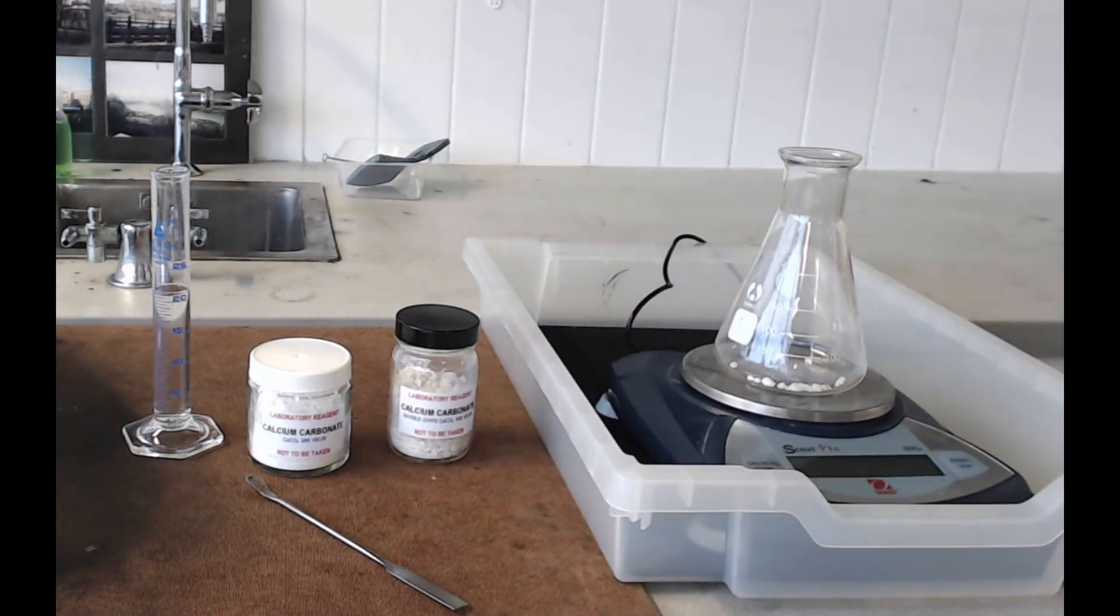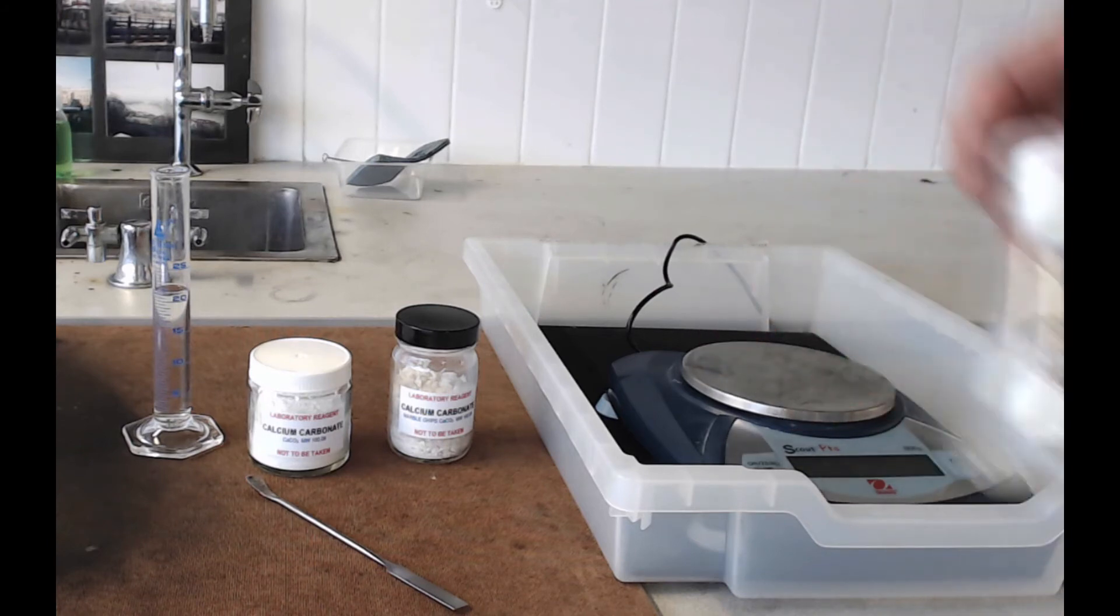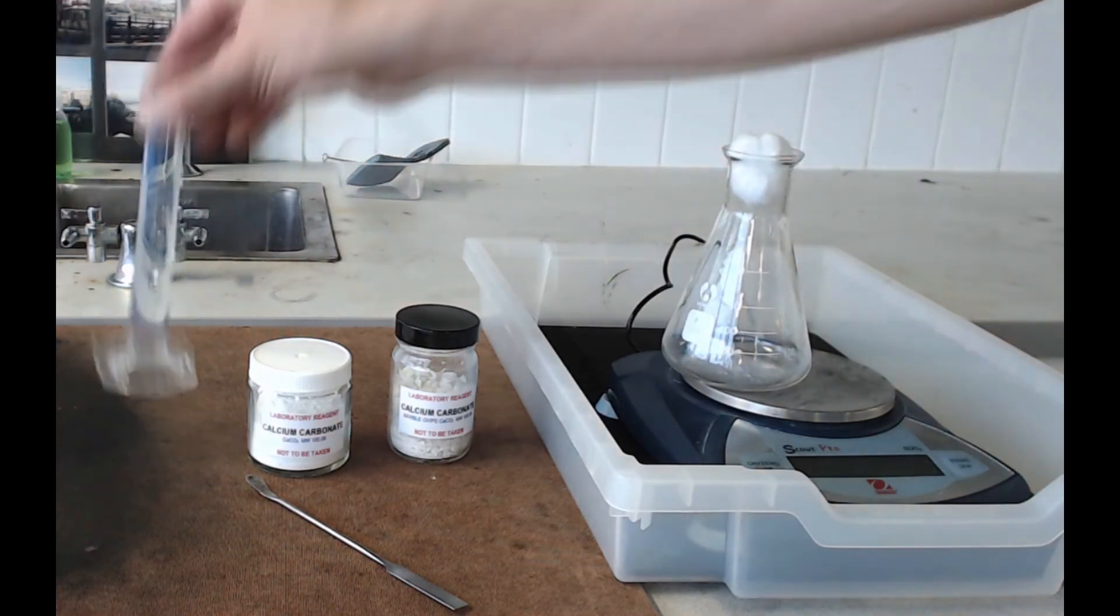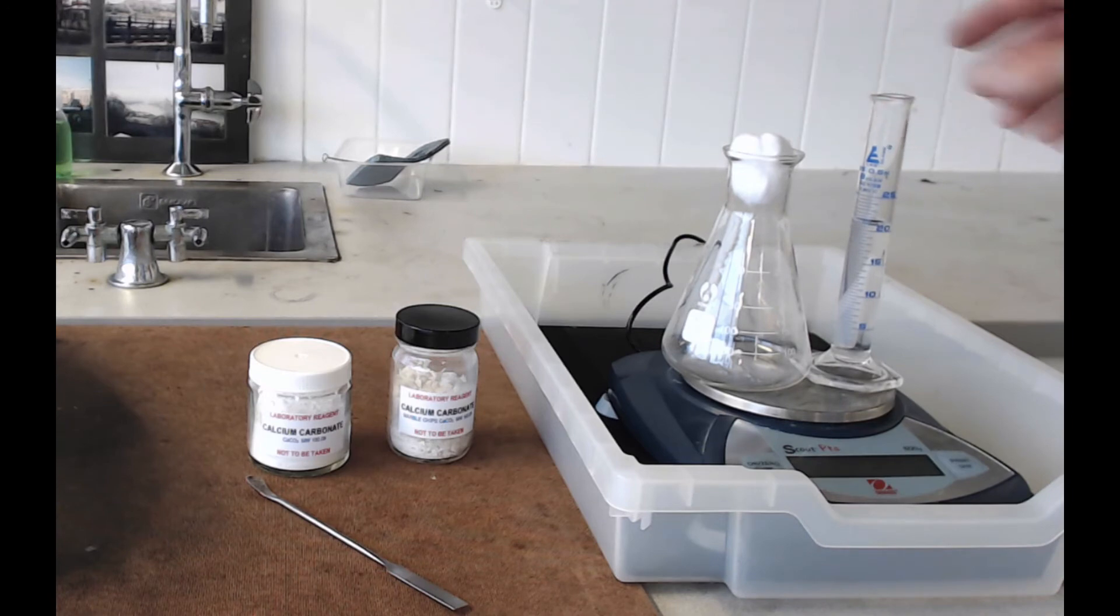Now the next thing to do is put your cotton bud on top of the flask. Take the flask off the balance and zero it. What you want to do now is weigh the measuring cylinder, the conical flask with the marble chips, the acid, and the cotton bud all together on the balance.